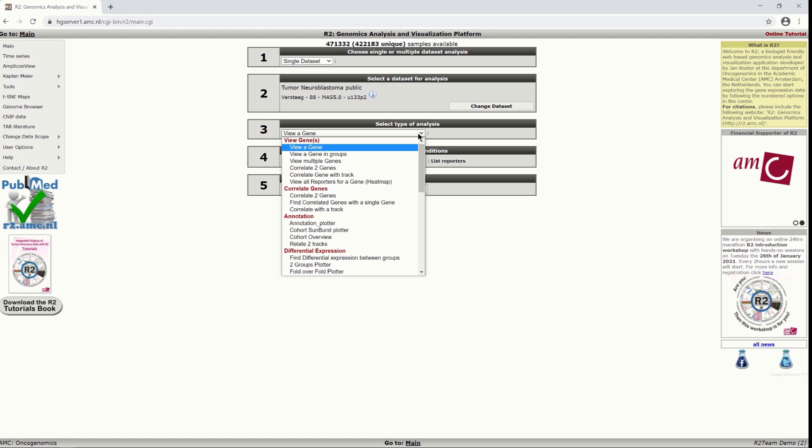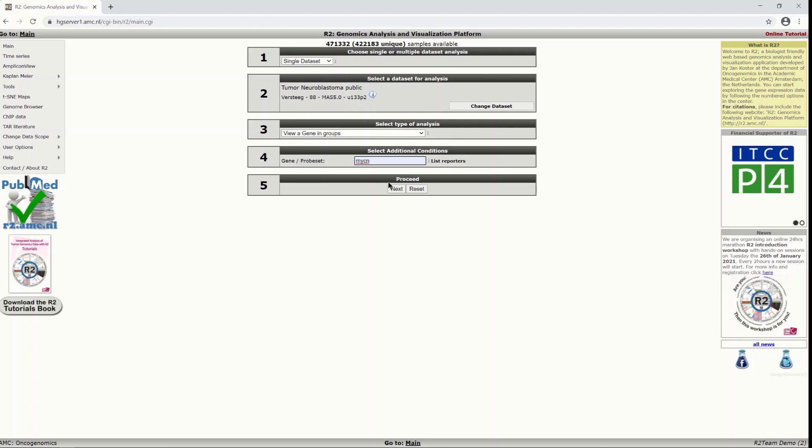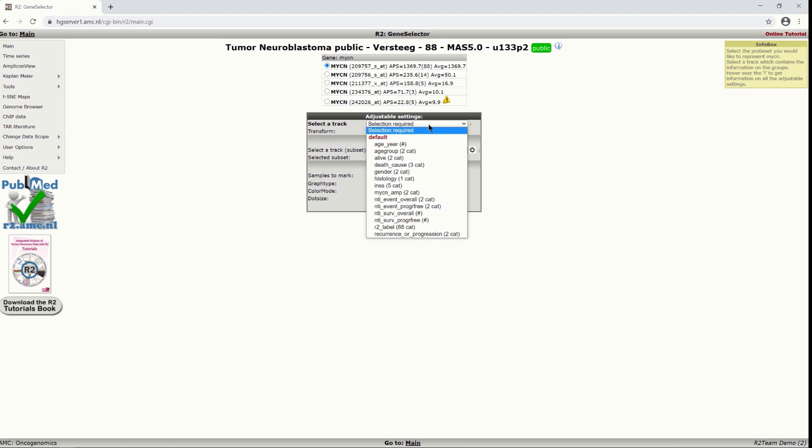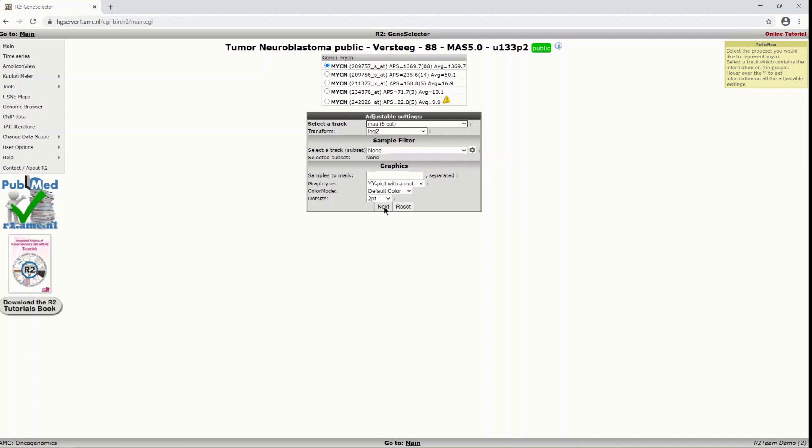We will start with the more simple module view a gene in groups. You can just add a gene here and click next and then there is a track required that has the information of the group division that you want to apply. In this case I am interested in INSS track. I want to see if staging has anything to do with MYCN expression. So I click next.